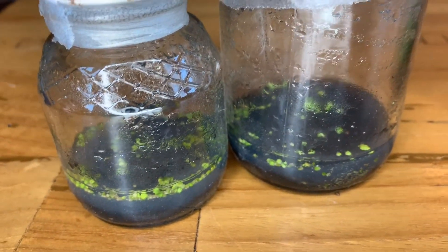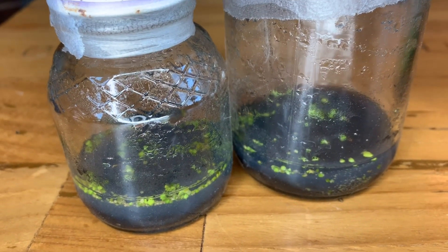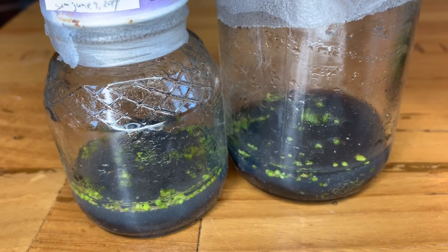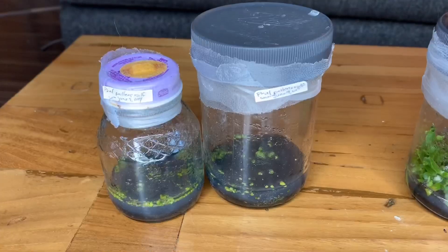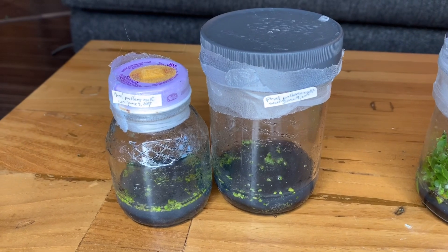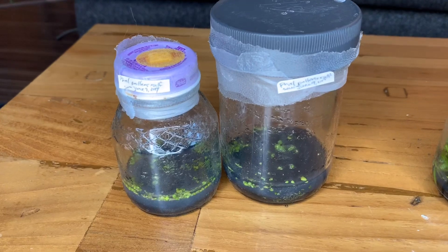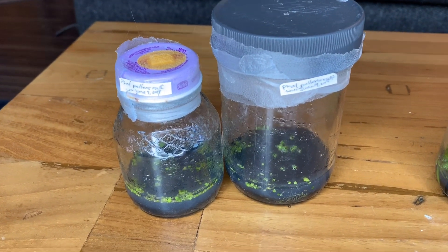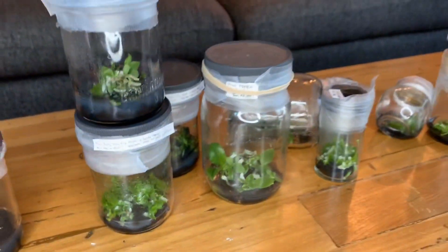It could be that I was messing around with the media and added too much sugar — maybe Palin specifically doesn't like media with more sugar or more nutrients. Considering I wasn't sure these were going to be viable because the seed pod had opened so early, I'm pretty happy with the outcome. My only concern at this point is that maybe those seedlings aren't going to make it to full size. We'll see how it goes.